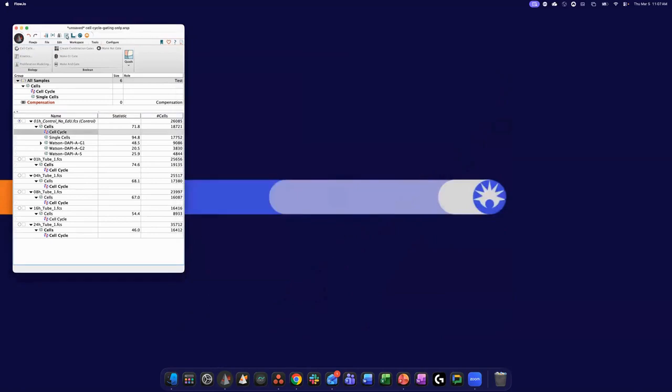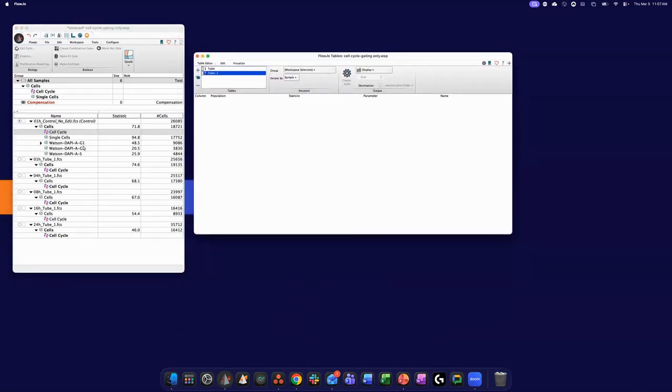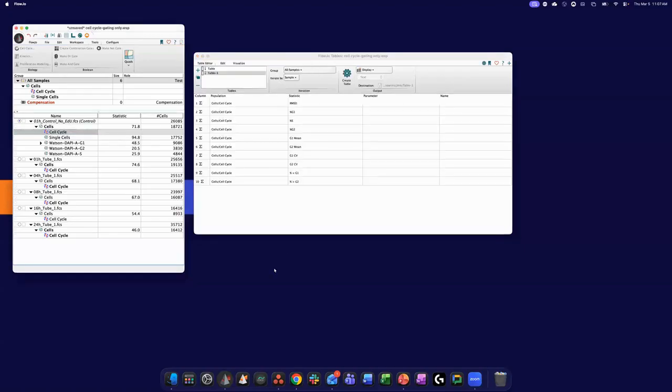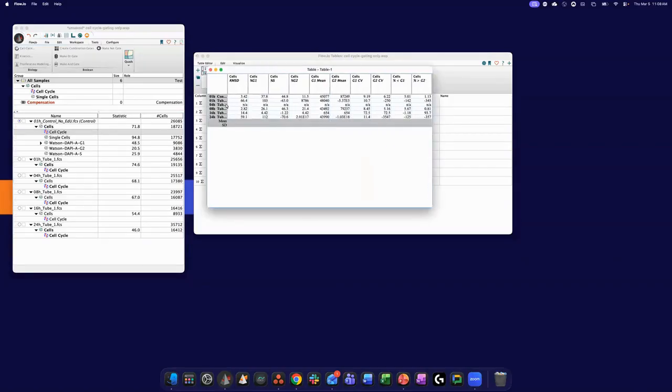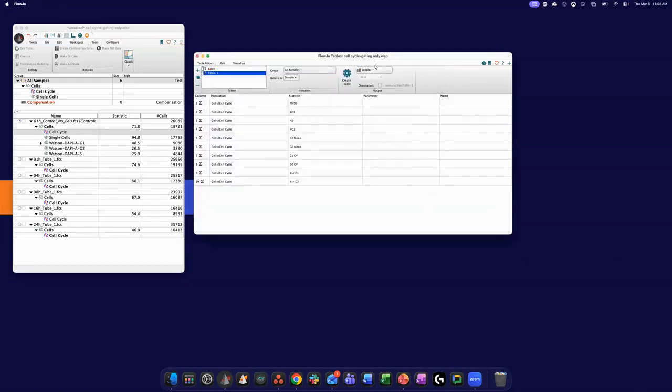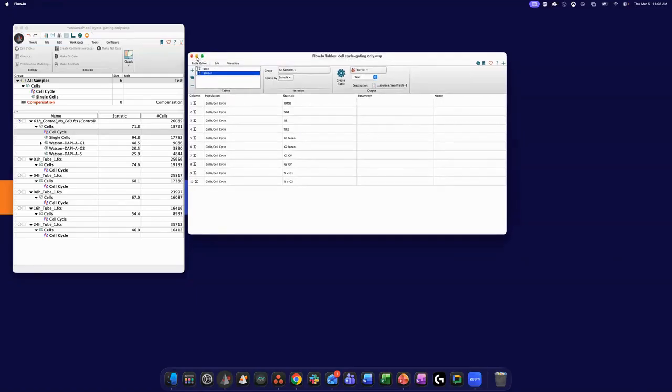And if you go to the table editor, right next to the layout editor, I'm going to make a new table here. If you drag in the module node, it will give you a table with the stats. You can see here I don't have any stats for one of the samples, but all the same statistics that were in that module, you get them per sample, okay? And then you can export that table as per usual, okay? Right, so those are the outputs from the one-dimensional univariate analysis.